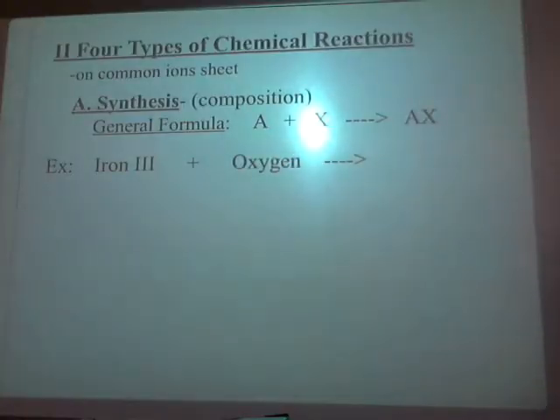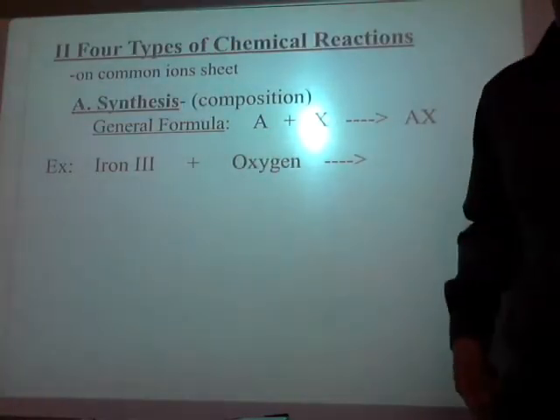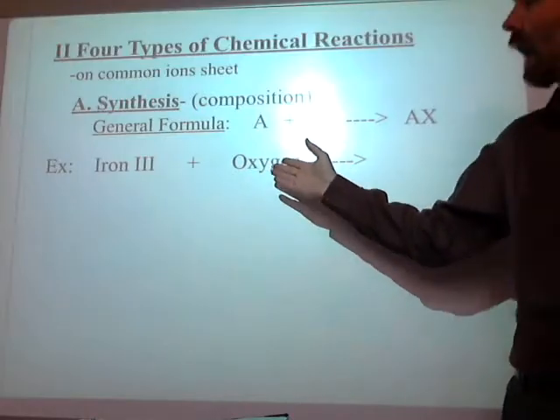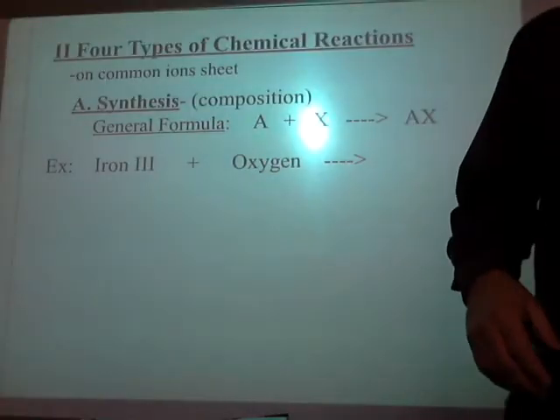And I'm going to call it iron 3 just so you know what the charge is. But the fact is you wouldn't know that ahead of time. All right, but I'll call it iron 3 over there. And I'm going to add oxygen to it. Now, I've already done this.